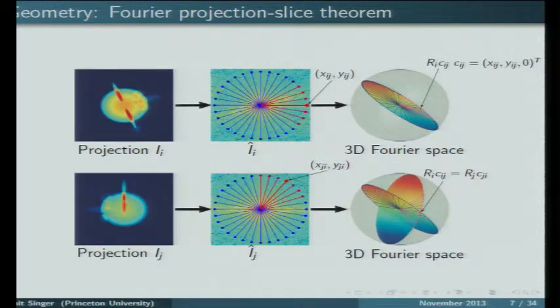You can find that line, say, by using methods such as normalized cross correlation. Then you know the relative orientation between the two planes up to the angle between them. So there is still one degree of freedom left. Yeah? So is the top line, both of them are 3D Fourier? Right. So here, this is 2D projection, 2D Fourier, 3D Fourier.